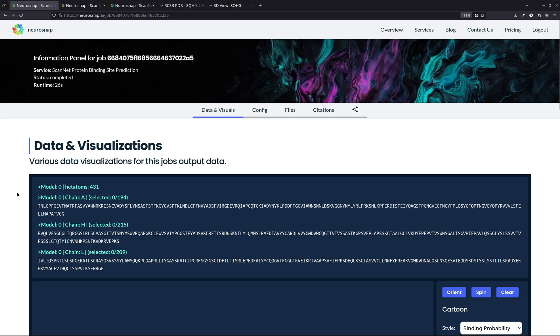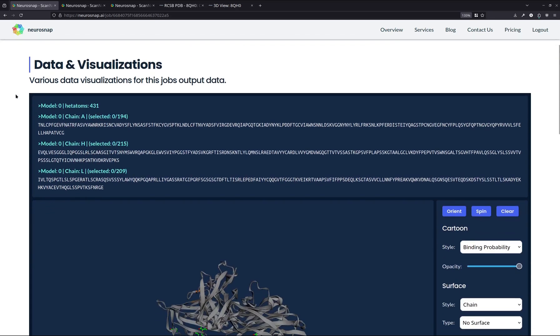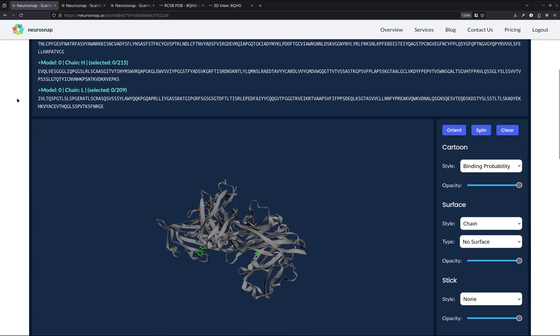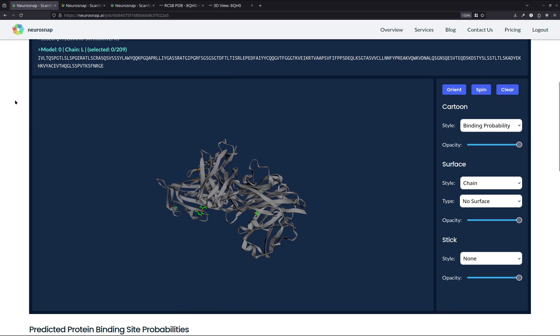All right, so we're now back with the results. And as we can see, this job took hardly any time to complete at all with only 26 seconds of runtime, which is fantastic. And now what we're going to do is we're going to go to the most interesting part of this analysis, which is in my opinion, looking at the structure.